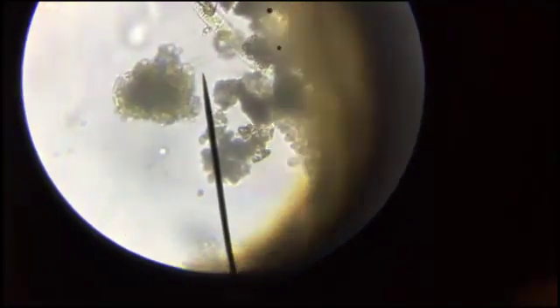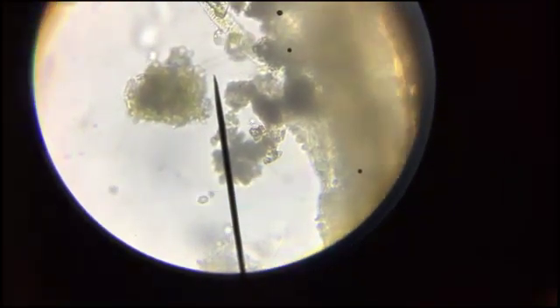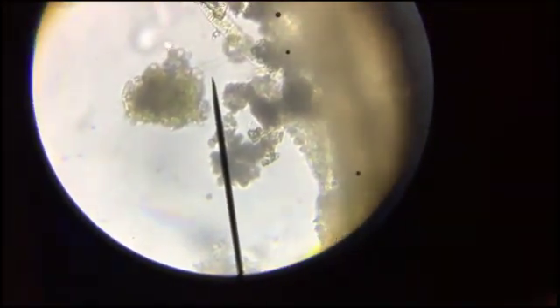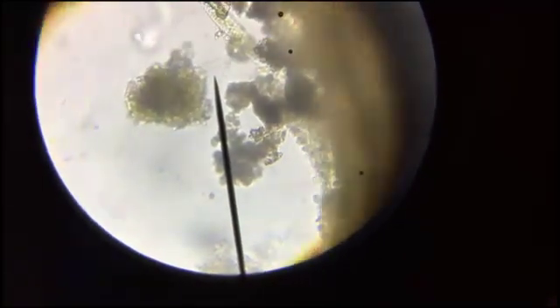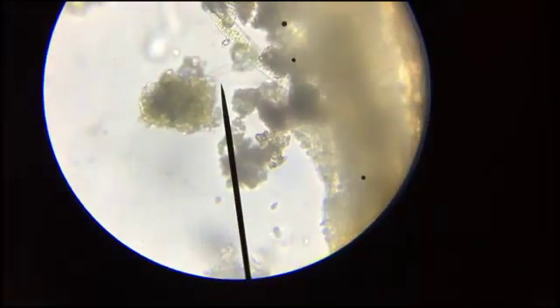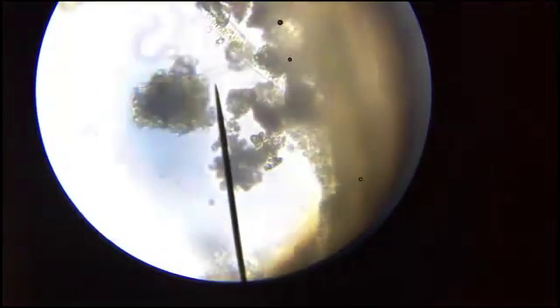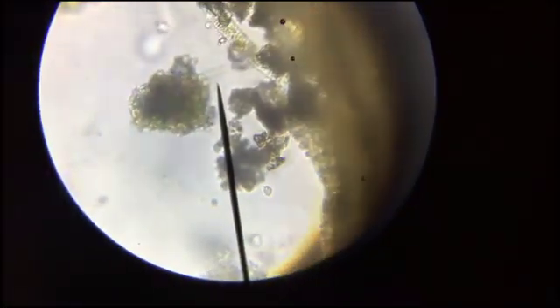There's the same view on 400 times. There's a whole city of little critters, protists, zipping around. Look at how many there are. One little corner of a drop of water. Unbelievable.